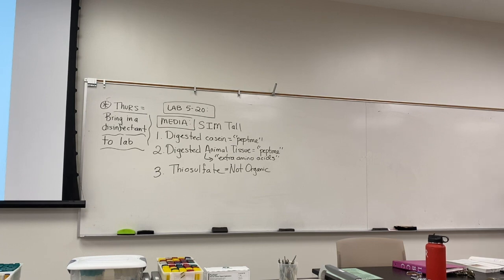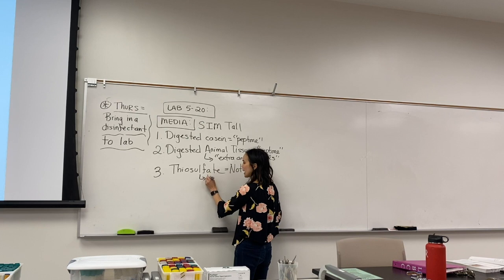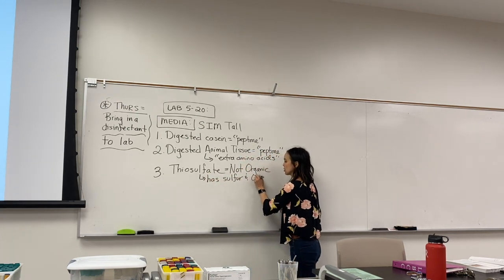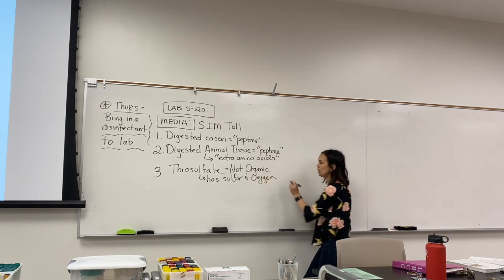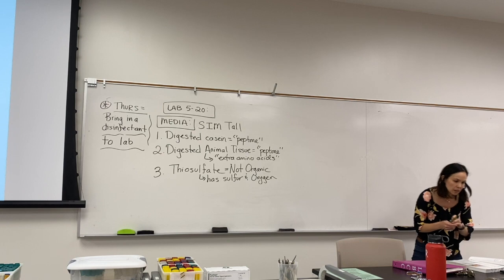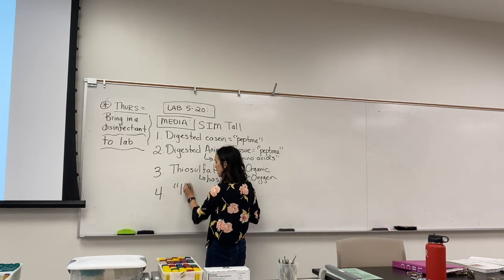It's not an amino acid, it's not a sugar. It's actually just a really, really small molecule. It has sulfur and it has oxygen in it. And then other than that we have some ferric.